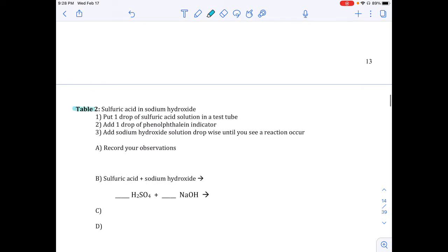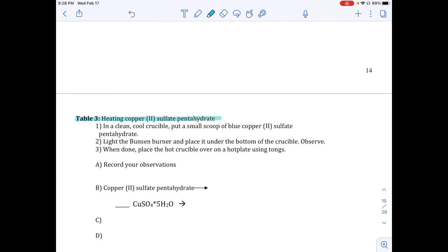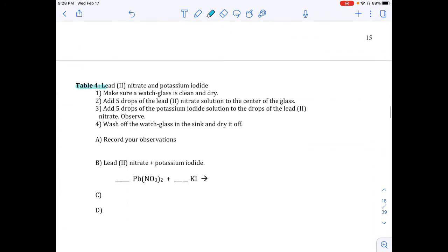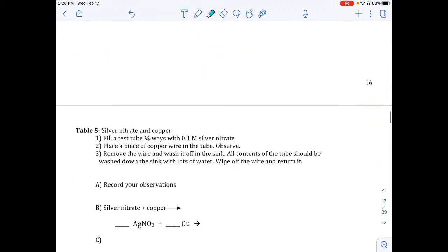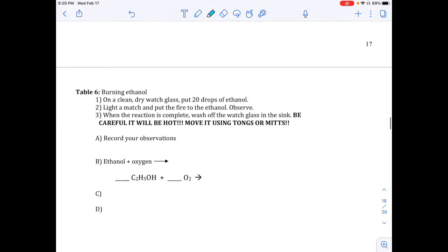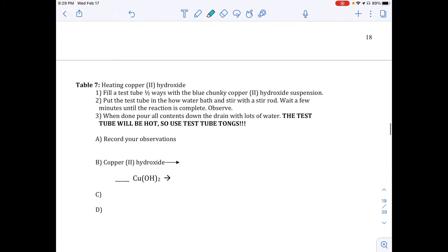The seven tables are: burning magnesium; sulfuric acid with sodium hydroxide; table three is heating copper two sulfate pentahydrate; table four is lead two nitrate with potassium iodide — this is a toxic substance, so it goes in the waste container for proper disposal; table five is silver nitrate and copper; table six is burning ethanol; and the last table is heating copper two hydroxide. Let's get into it — let's do the lab.